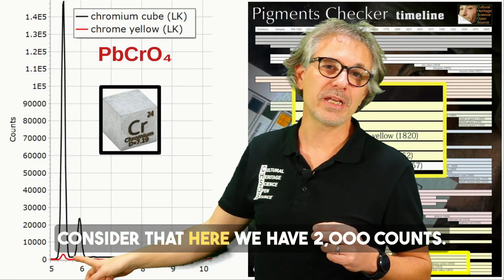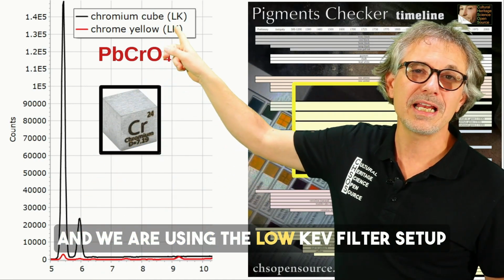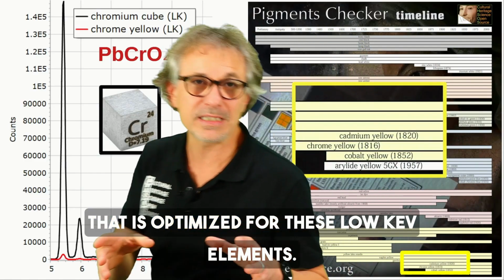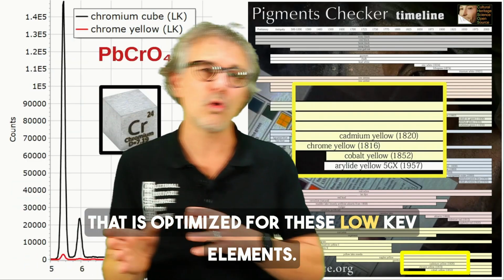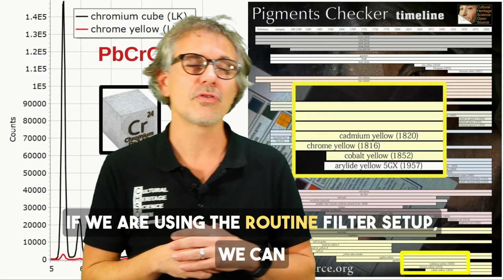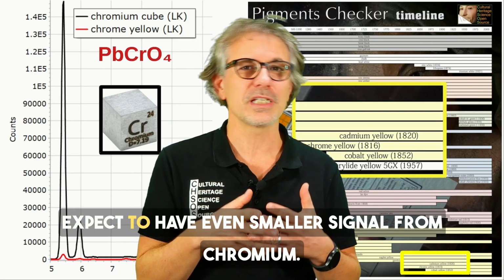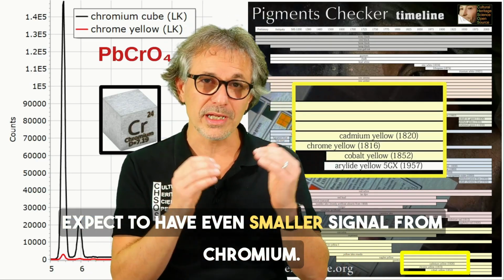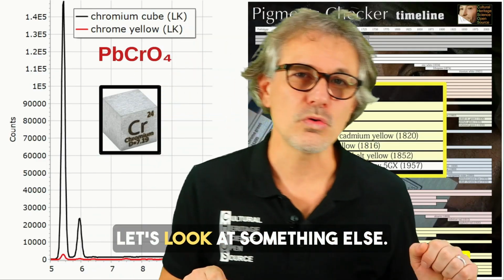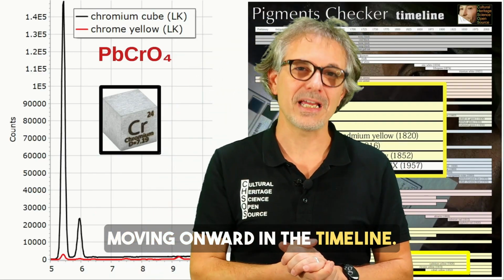Consider that here we have 2000 counts and we are using the low keV filter setup that is optimized for these low keV elements. If we are using the routine filter setup, we can expect to have even smaller signal from chromium. Let's look at something else, moving onward in the timeline.